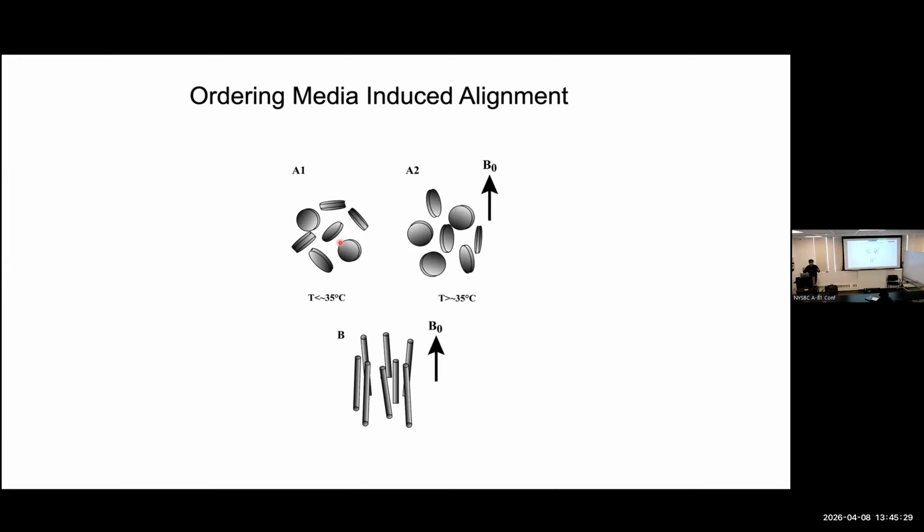And so why are those molecules aligning with the magnetic field? What causes them to? Why would this bicelle align all of a sudden? And by the way, the normal to the coin is perpendicular to the field. What's the physical phenomenon that causes their alignment? Why would bicelles align?